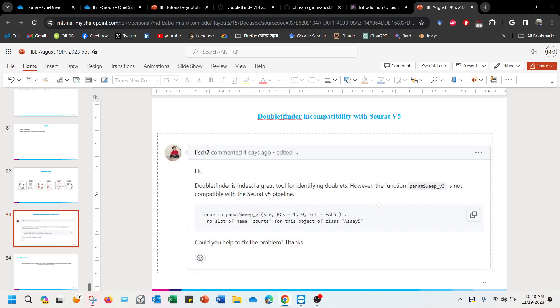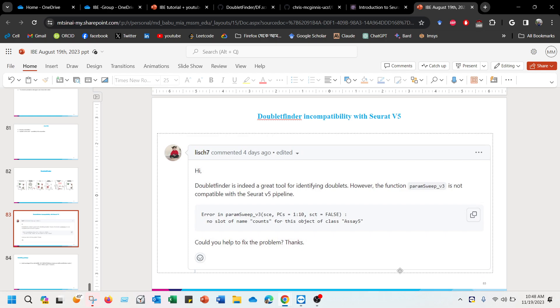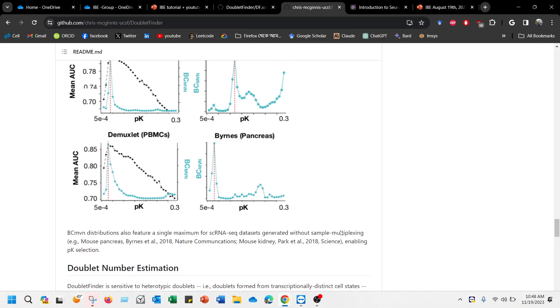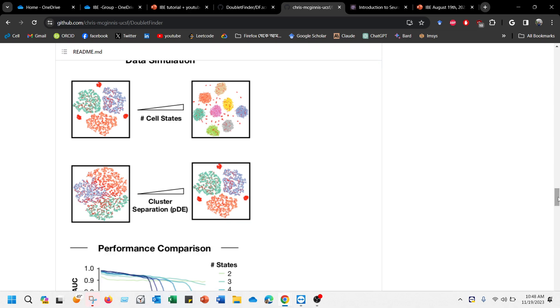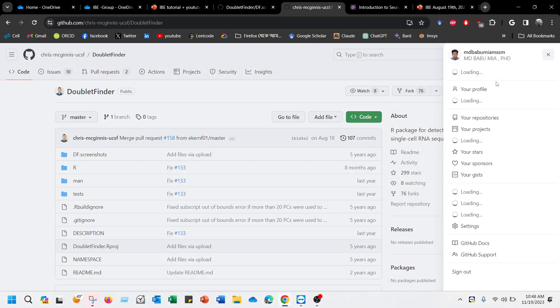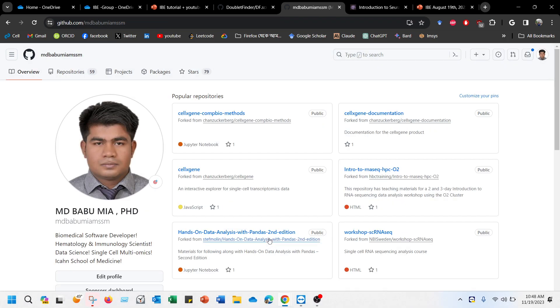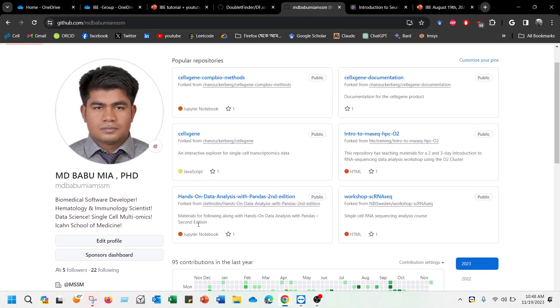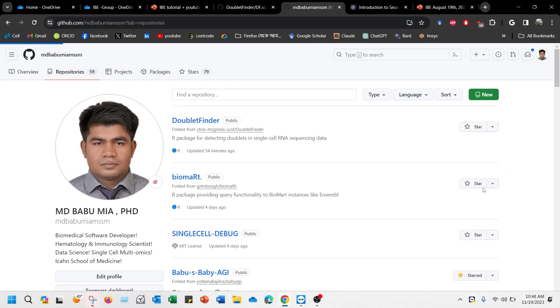He was asking to solve it so it's just three, four days ago, and understanding the problem with the help of some other programmers, I thought to volunteer on that and solve it. So let's go through and actually update whatever is required.